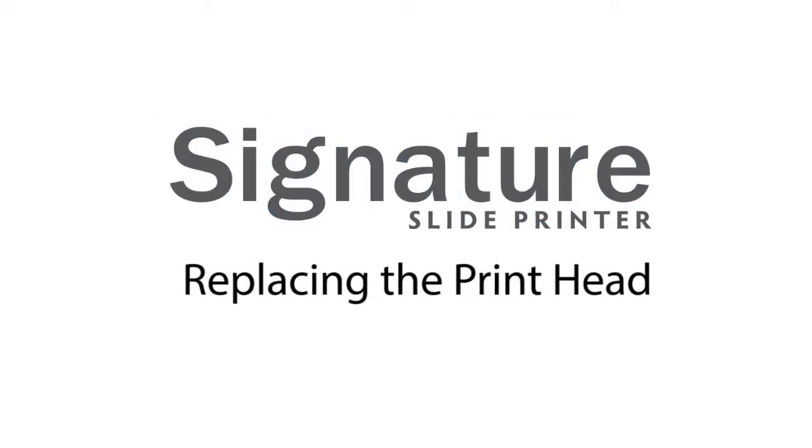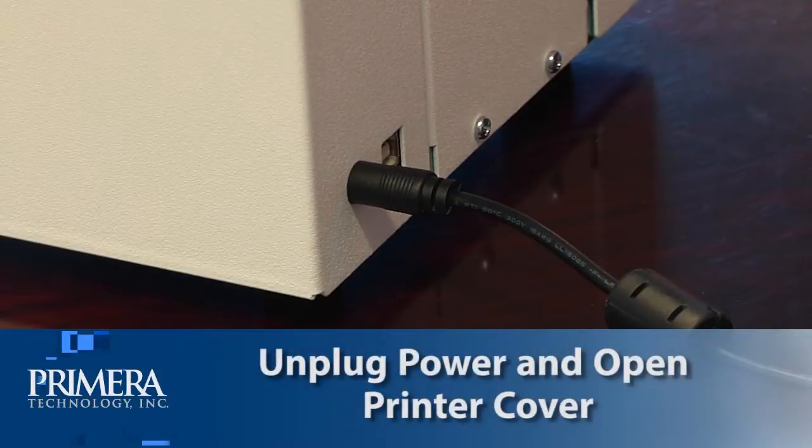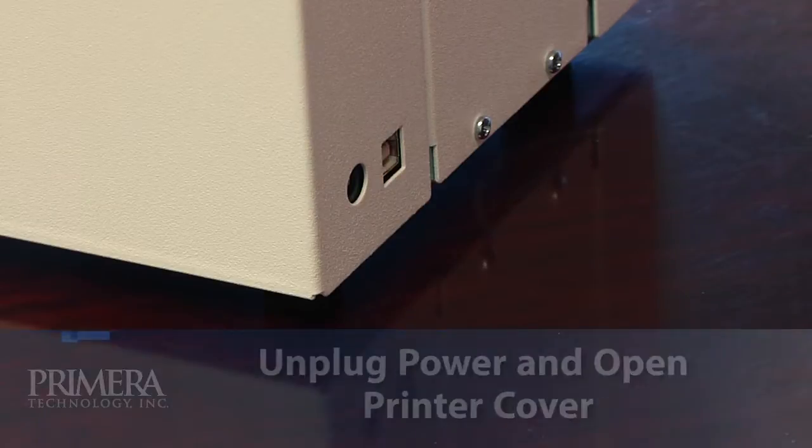In this video, we will explain how to replace the printhead in a Primera signature slide printer. To begin, unplug the power, then open the printer cover.